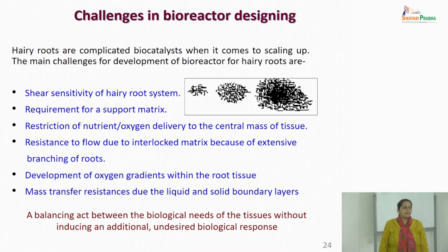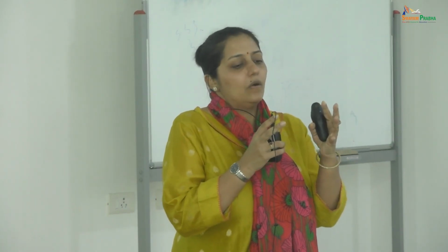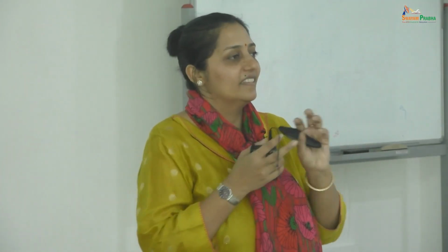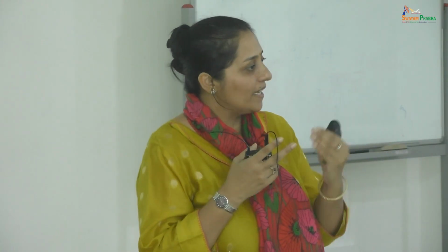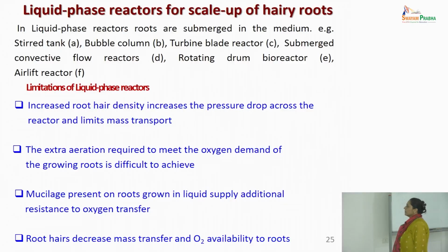Now, when I said, especially in case of organ cultures, that it will grow like a rough ball with all mesh, oxygen will be one of the critical components. After harvesting, if you open up that ball, you will see that the inside core is dead, necrotic. So if you can find a way of keeping oxygen flowing in during the entire cultivation, so that there are no limitations till the inner core, you may be able to improve your biomass and product productivities. So what can be done?